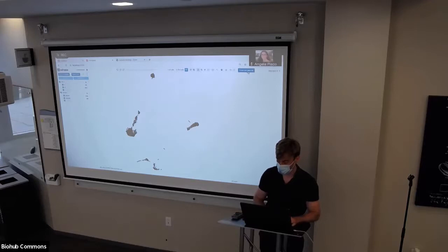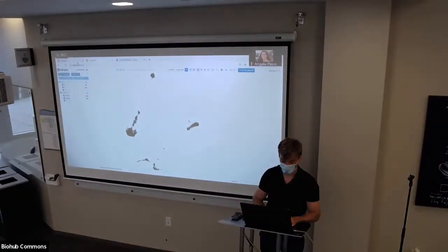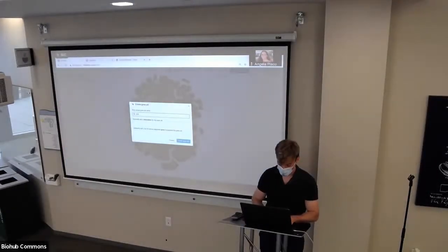So we'll create a new gene set here. Gotta go to Tabula Sapiens. Oh, right, this is the PBMC. We'll create a new gene set. I think it's, test. We'll call it test. ACE2. And then we'll optionally add a list of comma separated genes. I think it's all caps for Tabula Sapiens, so I'm going to try this.